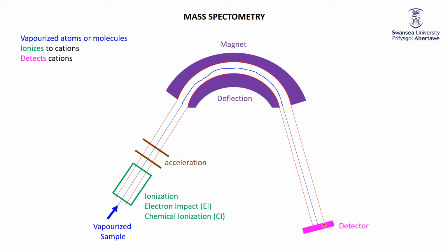So essentially the detector is arranged in terms of mass. But the fancy way to say it is mass over Z, mass over charge, which as far as we're concerned, Z is always +1. Now, the fun thing about this is that it's all to do with turning things into cations and then getting the appropriate amount of deflection.